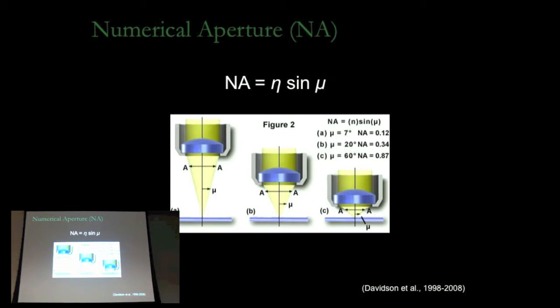When you're thinking about microscopy, most people first think about the magnification of the objective. But the little number that follows the magnification, the NA, is also very, very important. NA, numerical aperture, measures the light collection capability of the objective, and it's intimately related with the resolving power of the objective. Okay, so the equation is given here.